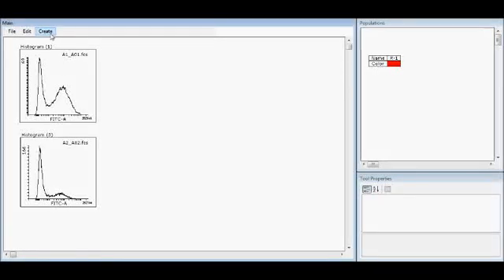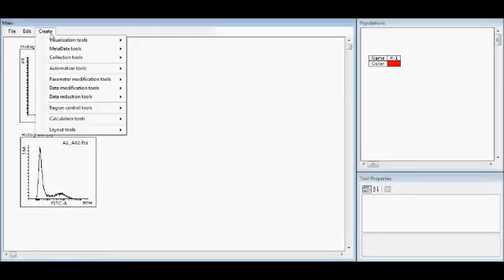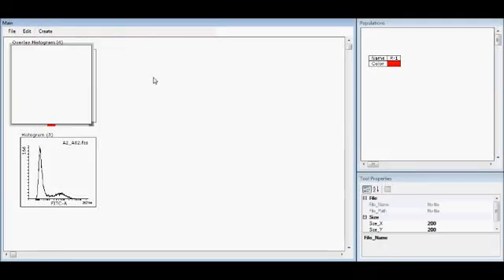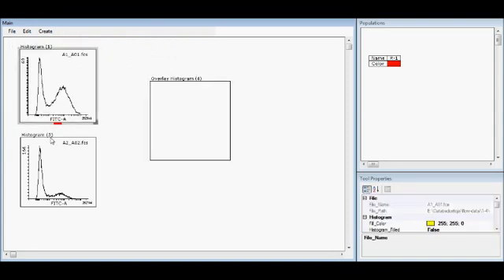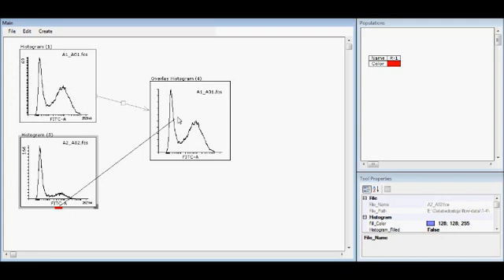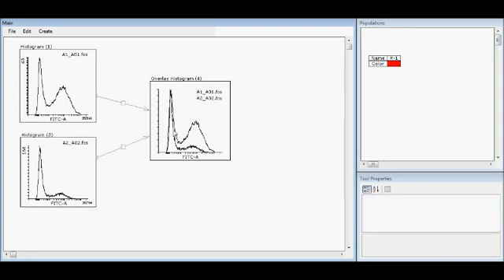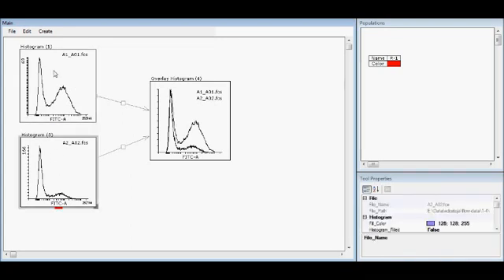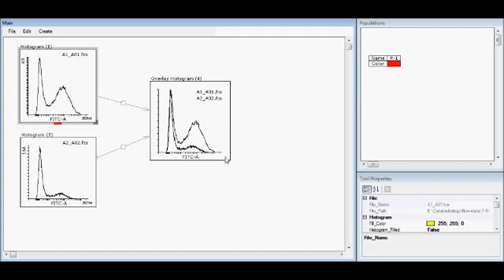Using the overlay histogram is easy. Under visualization tools, let's create one — you just add or connect any number of histograms into the overlay histogram and they are visualized there. Every time when you do something to these histograms, it will be reflected in the overlay.